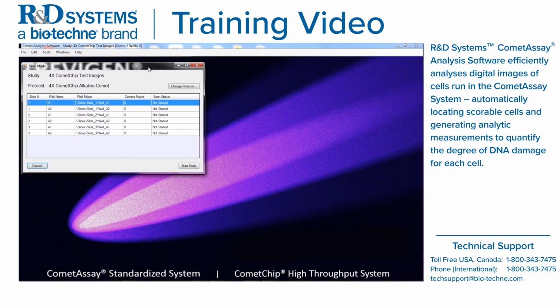Oh, one thing you should note, at the top of the software program, you actually know what study or experiment you're in. It's listed at the top here. Okay, so we haven't actually started to scan yet. But what you can see here is that, again, you have your study name. This is the protocol we're going to use during the scanning. Again, we had 3 slides, 2 wells per slide. In this window, you can see that our scan has not started yet and the software hasn't found any comets. So let's go ahead and start the scan.